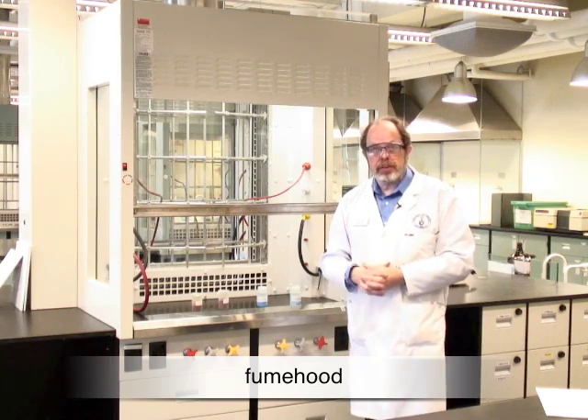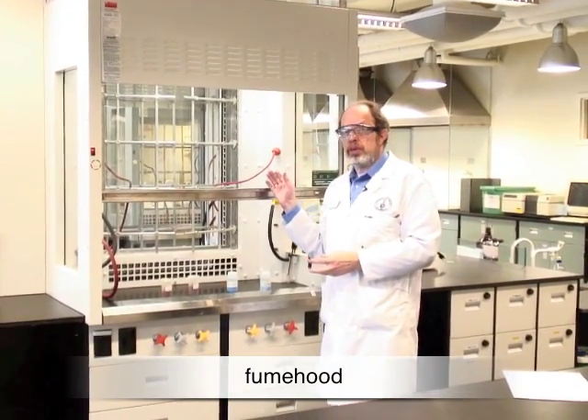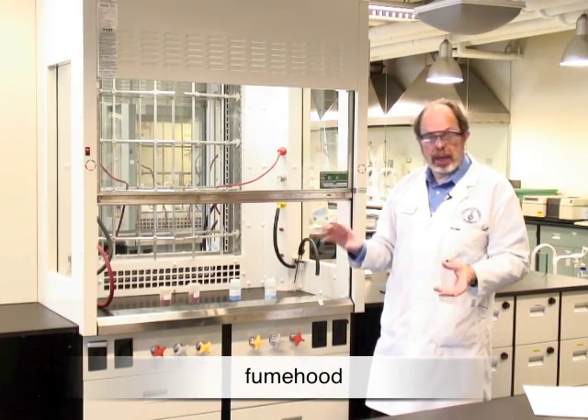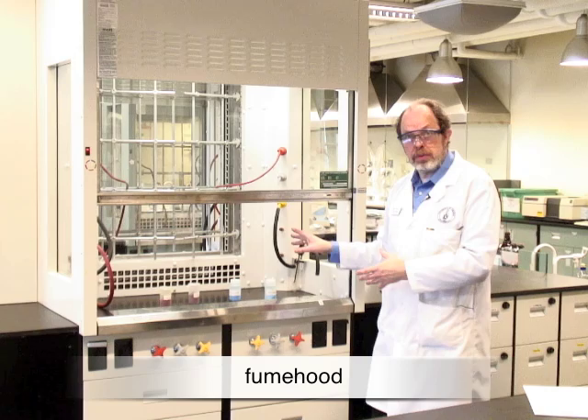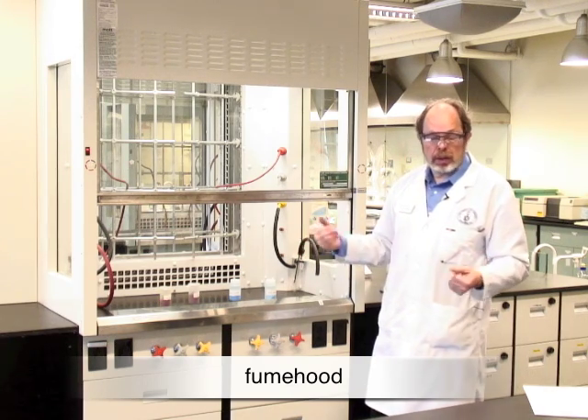Let's talk now about laboratory-based safety equipment. Most important of these is the fume hood. It's designed to remove toxic fumes, so if you can work inside the fume hood please do so. That minimizes everybody's exposure to noxious chemicals.